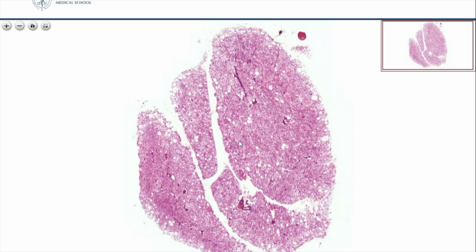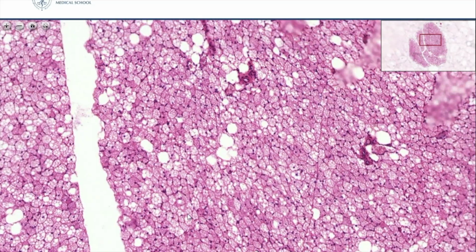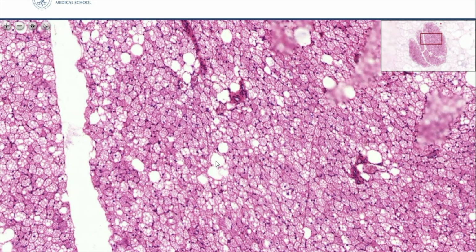This is also a cell-rich type of connective tissue, the brown fat. If we look at the brown fat tissue, then we will see always a few white fat cells also. These seem like empty rings. They are truly empty rings because during the histological procedure the fat was dissolved from these cells.